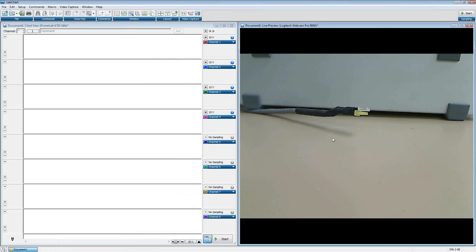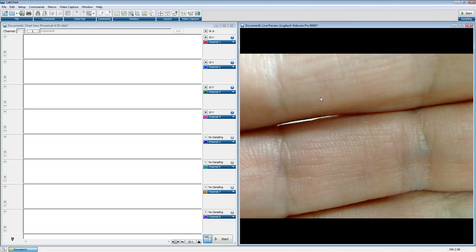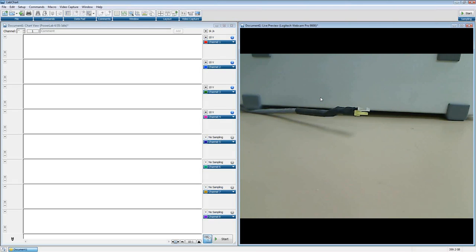So, as I said, we'll start talking about digital inputs and outputs. I'm also going to direct you to, I'm inputting a live video into LabChart with our video capture module. We do have webinars later on that explain more about it, but it's a way to pipe video into LabChart and record it with a file. But for today's uses, I'm just going directly to a camera that's recording live here. So let's go ahead and let it refocus, and we'll move on to digital inputs and outputs.